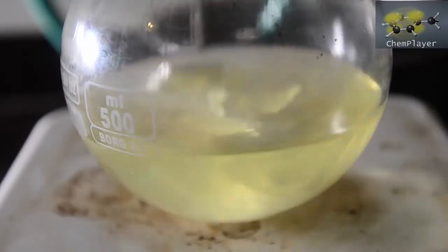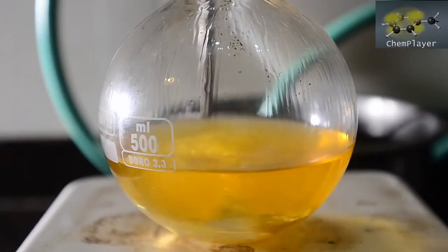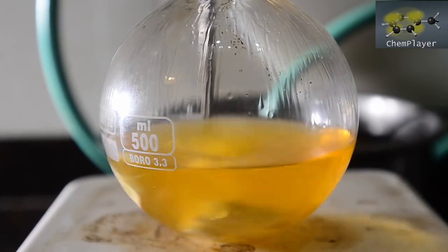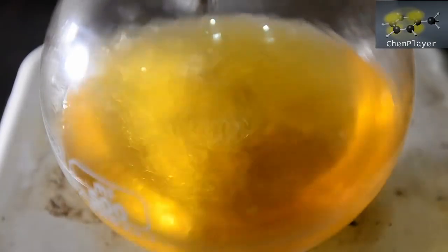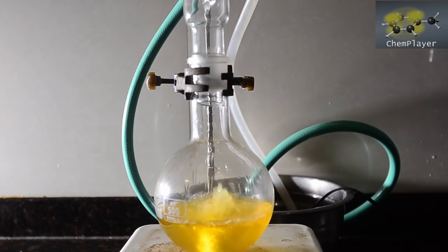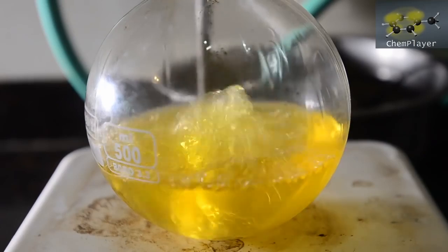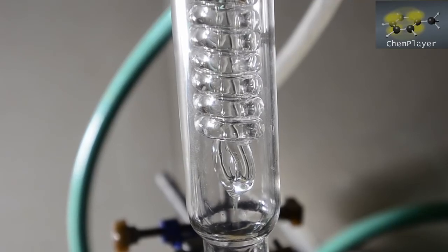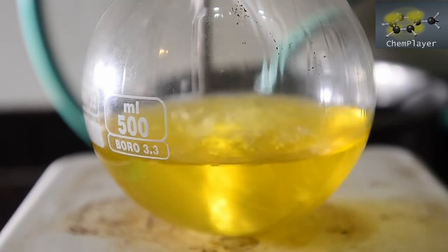The temperature steadily increases and the mixture turns yellow and then a definite orange color. This is slightly different to sodium reacting with just pure ethanol. And then, as we reach the boiling point, the reaction kicks off. And boy does it kick off. The sodium gets hot enough to melt into a ball in the center of the flask with the stirring.